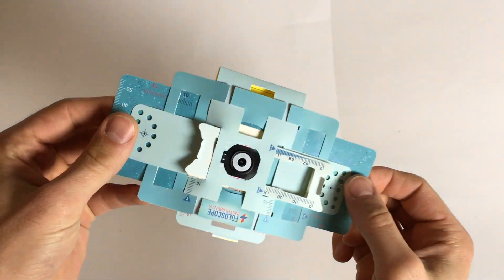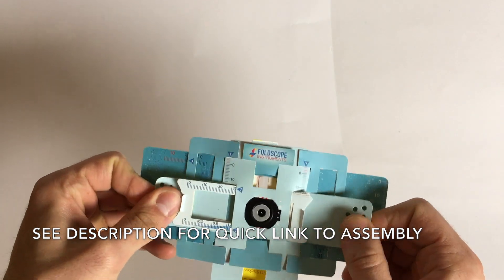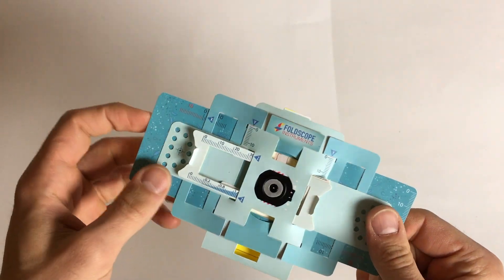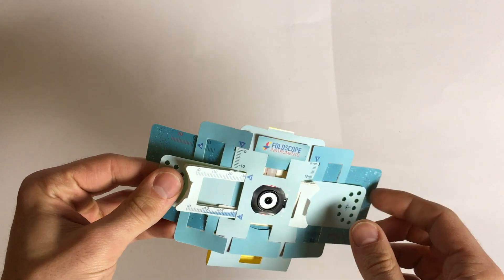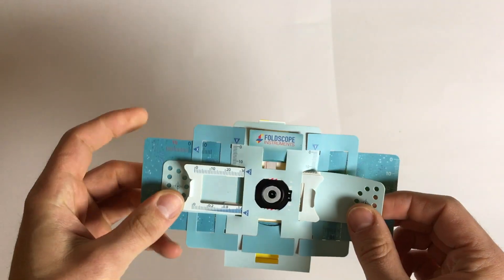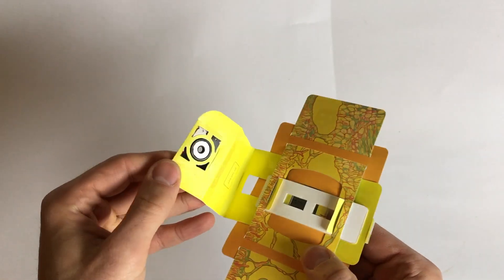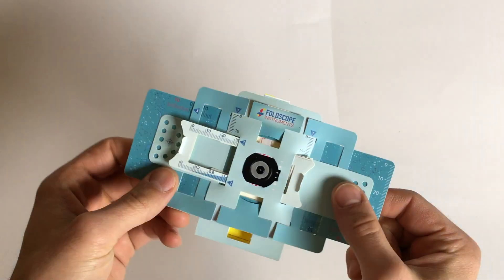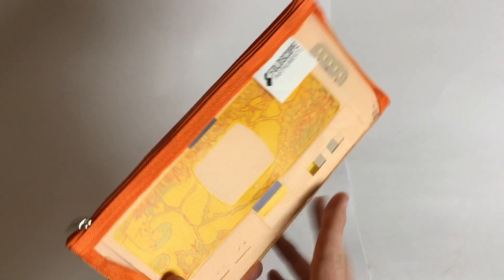This is the Foldscope. This is a 50 cent to one dollar microscope meant for classroom use and for people with no access to microscopes. It's almost completely made out of paper, and today I'm going to show you how to build one.